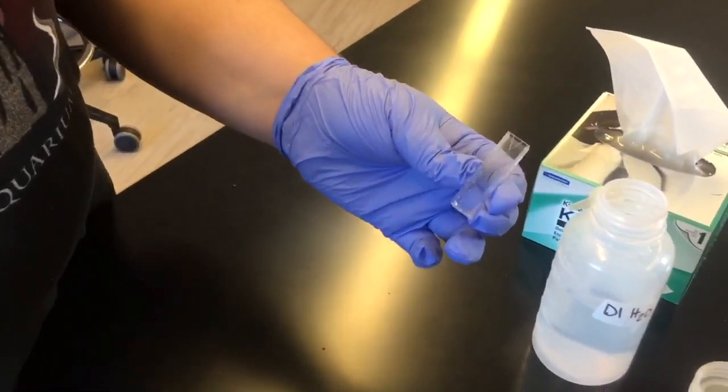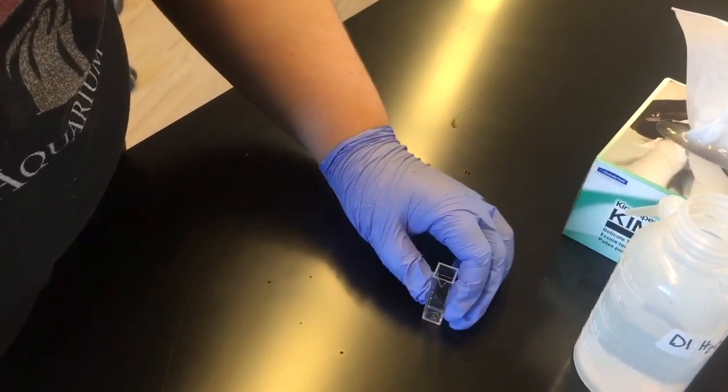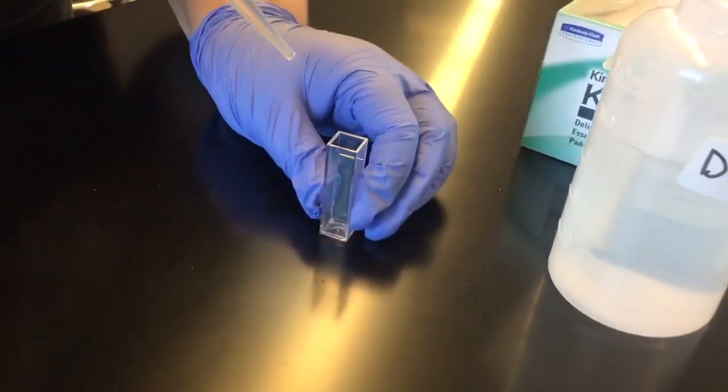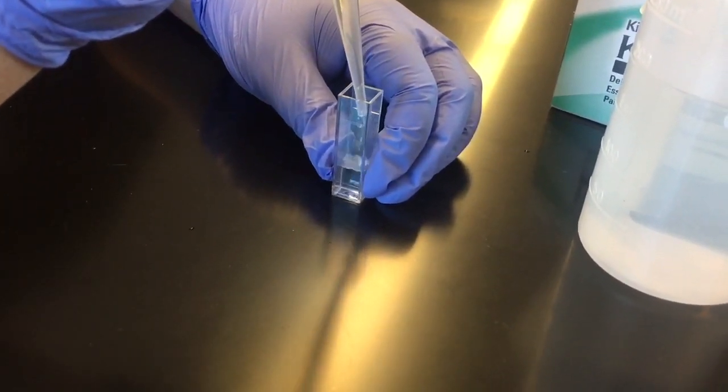This is your cuvette, and you want to make sure that it is clean. What you're going to do is put it down and take—I'm using DI water—you're going to fill up your solution all the way up to that line below the arrow.